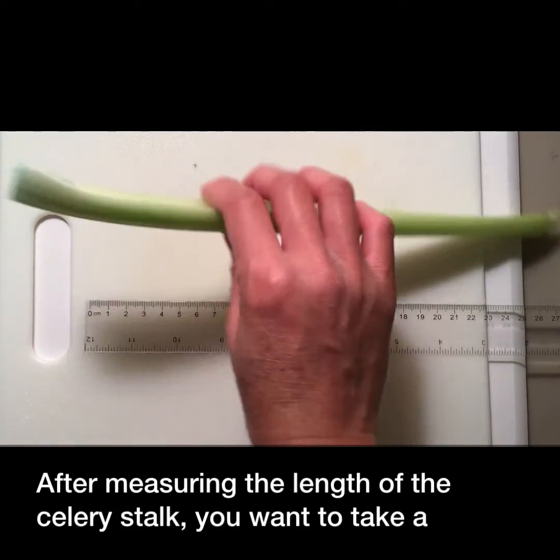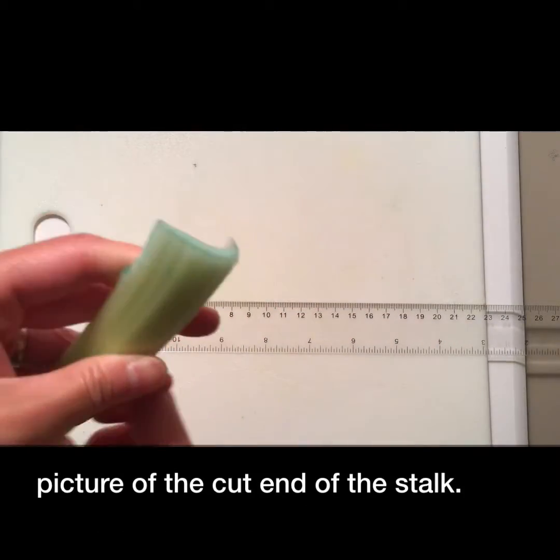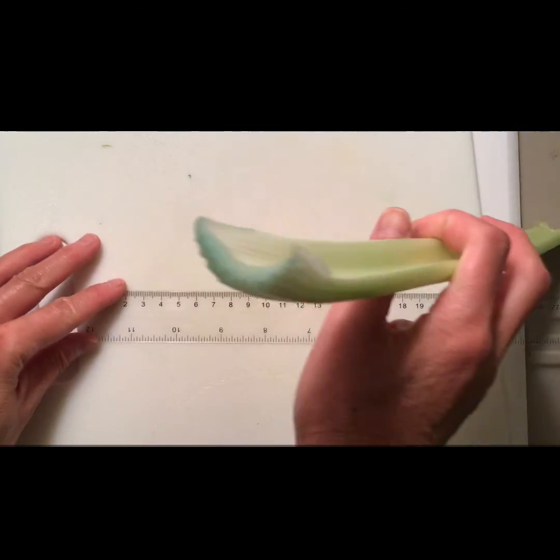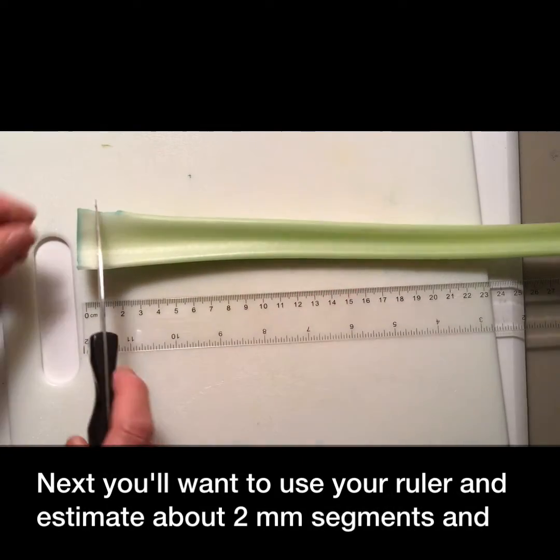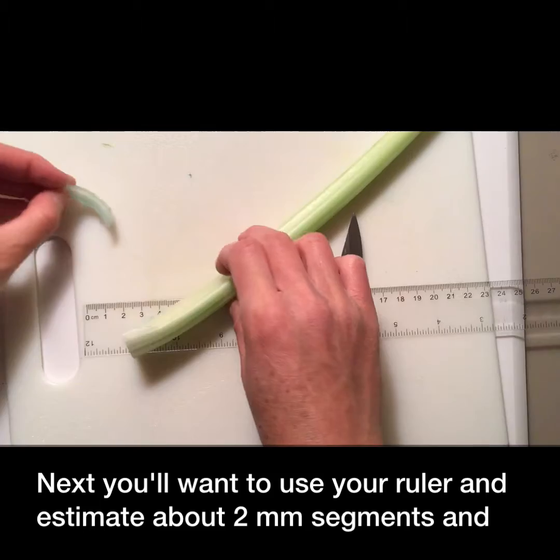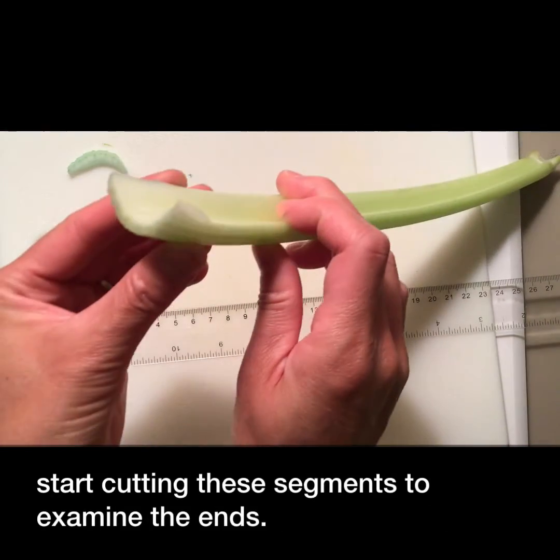After measuring the length of the celery stalk, you'll want to take a picture of the cut end of the stalk. Next, you'll want to use your ruler and estimate about two millimeter segments and start cutting these segments to examine the ends.